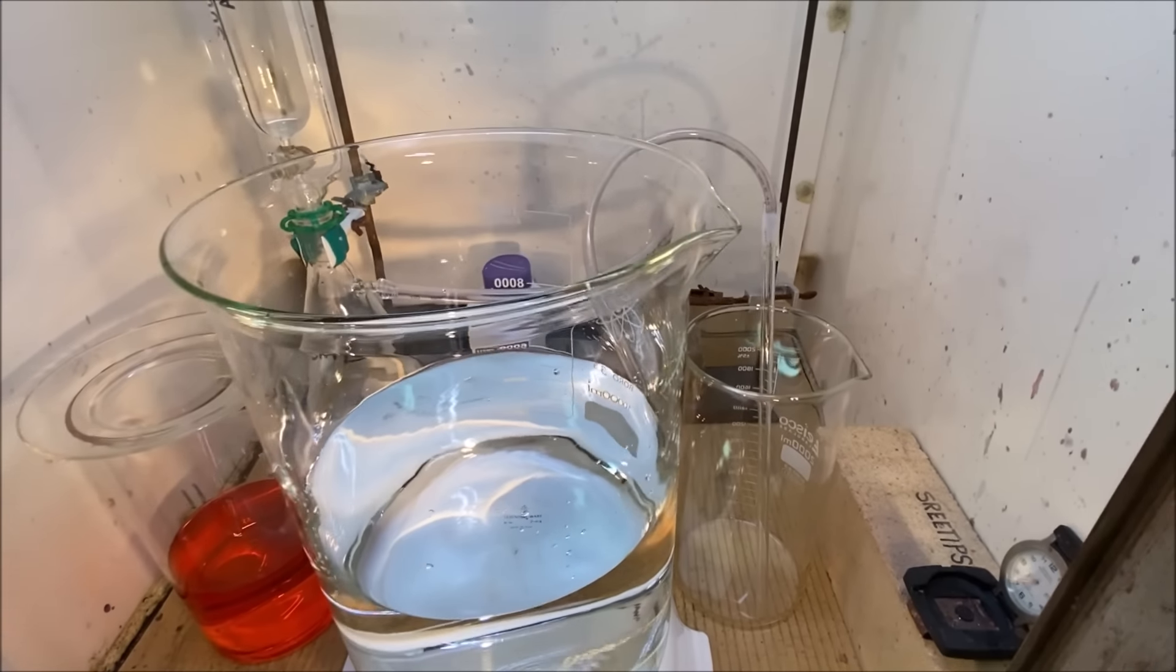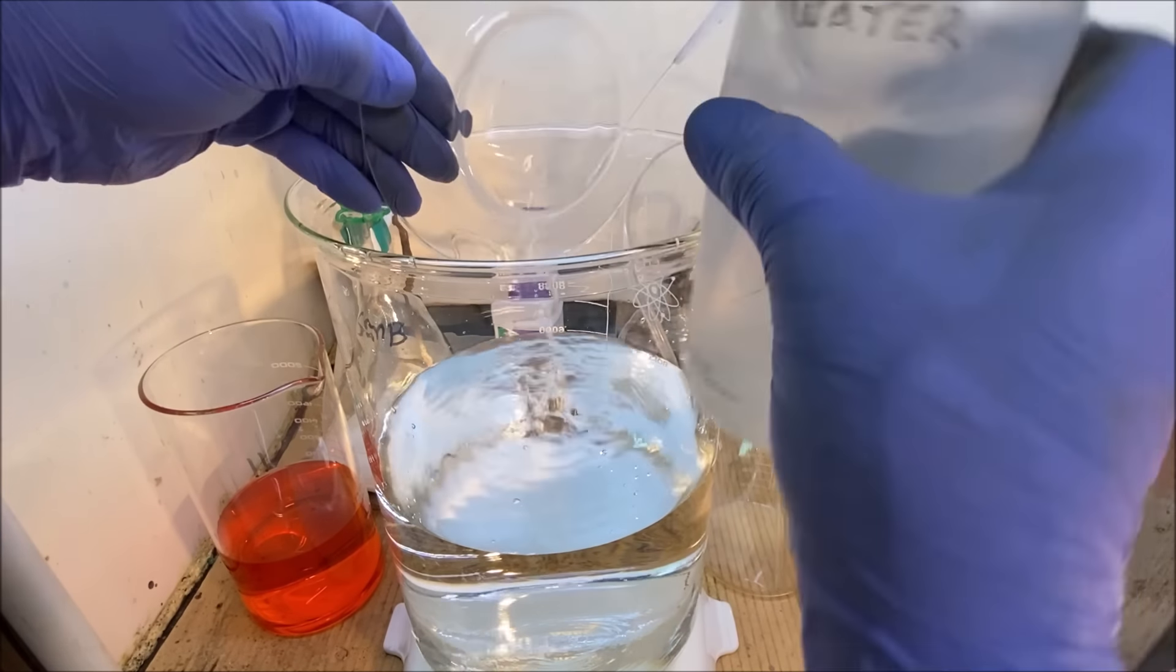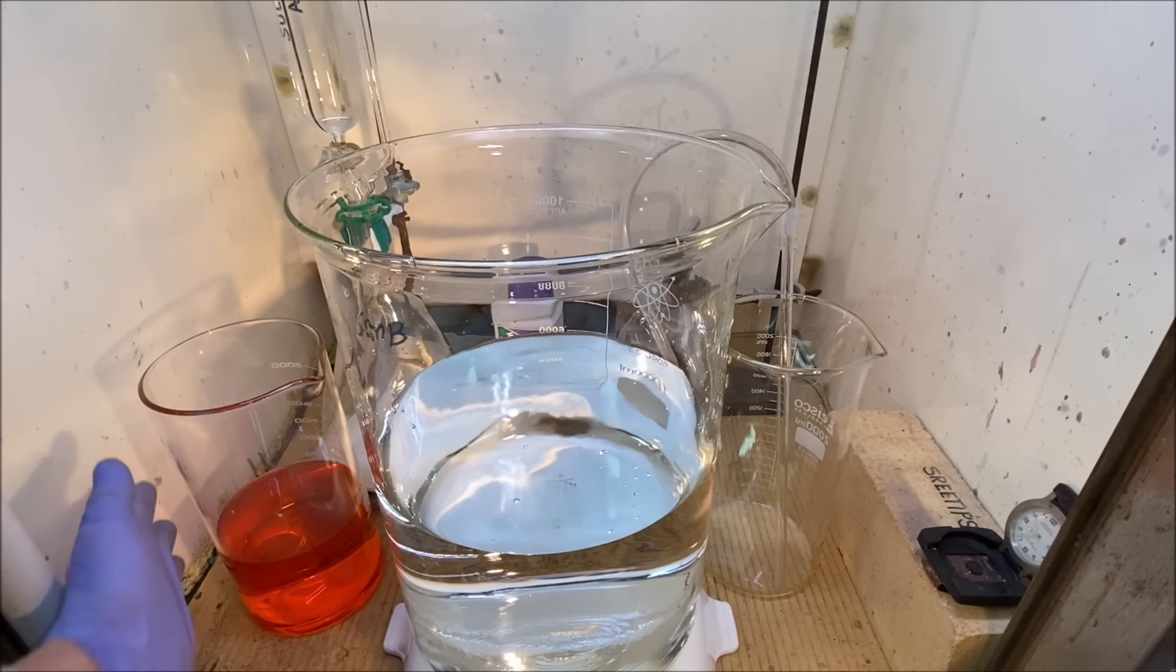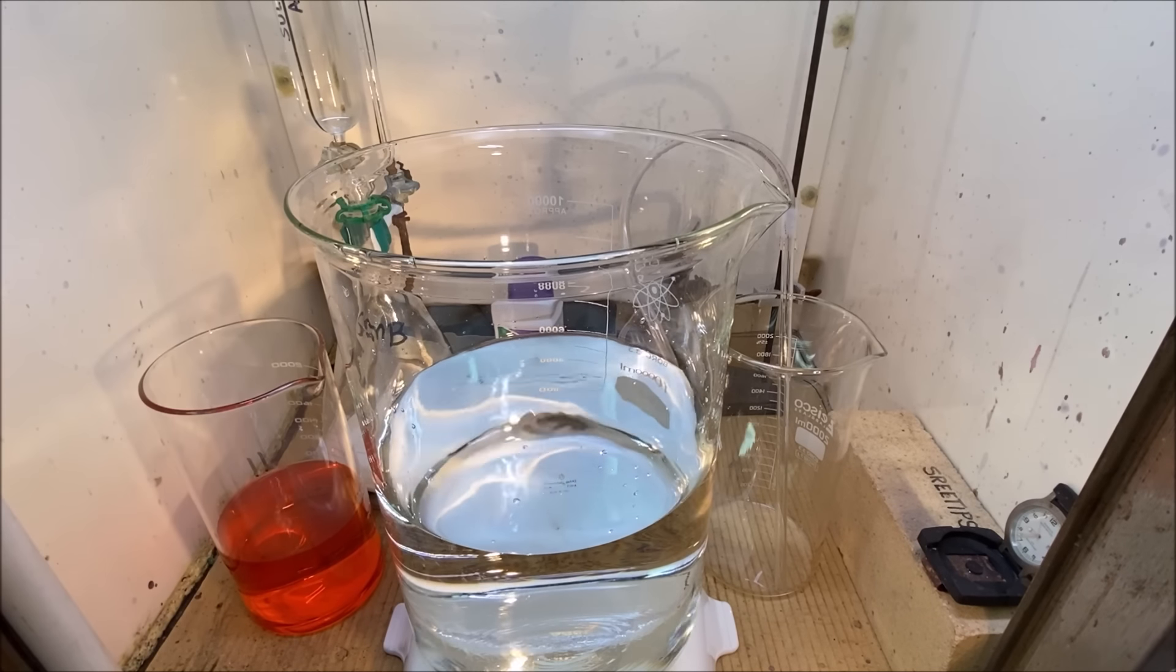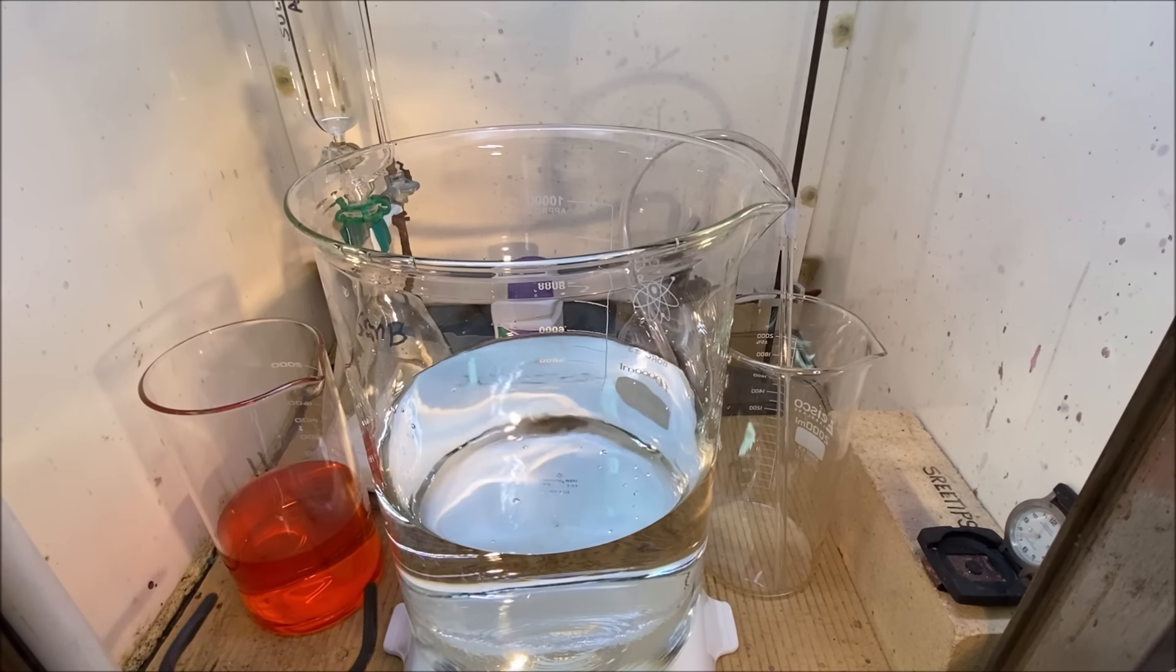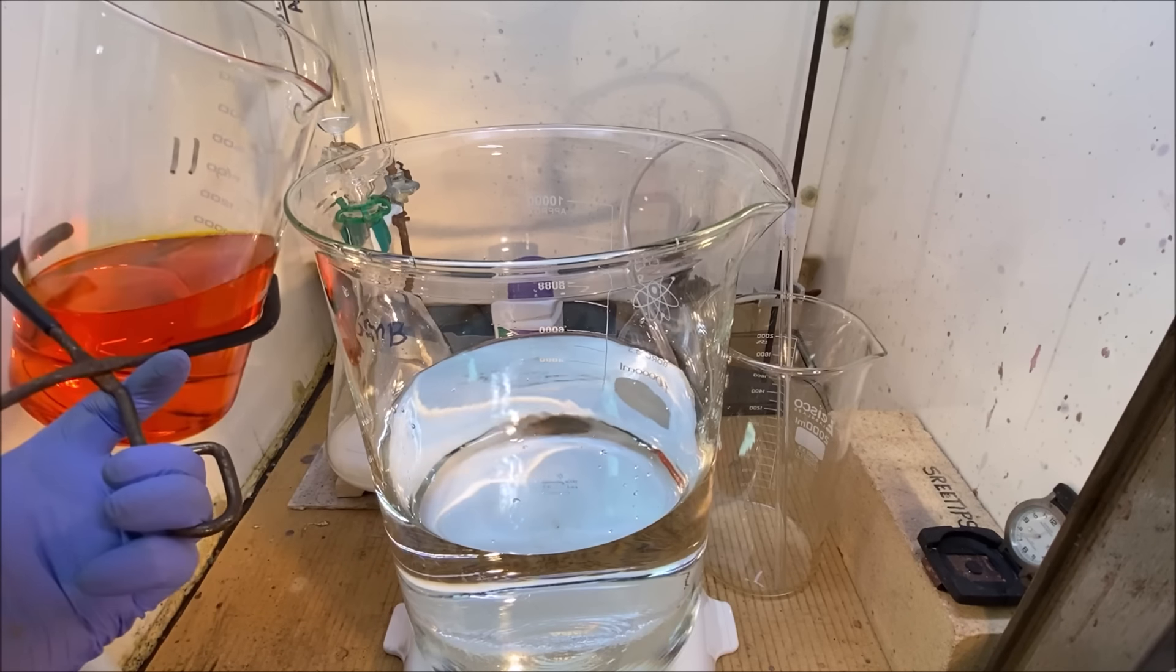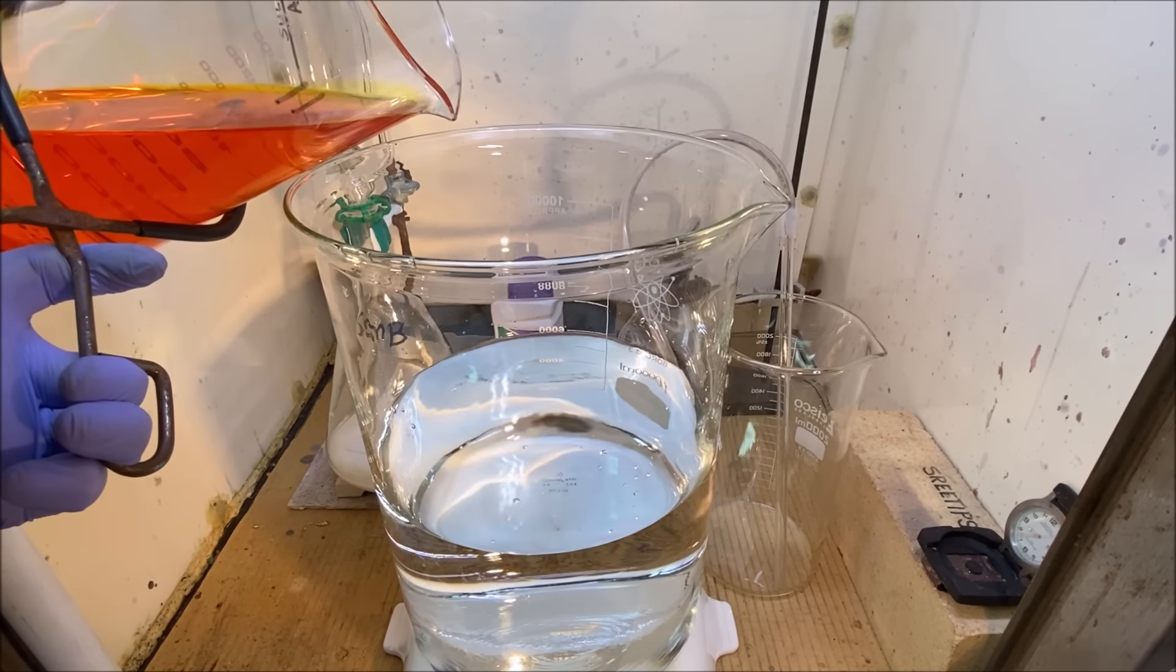All right, we've got a bubbler back there way in the back and that tells us that we've got a good gas flow going. Now we're going to add this gold solution to this water. I didn't even filter it. It's going to add this chloroauric acid solution right on into the 10 liter beaker that's got our distilled water. I'm going to add this right on in now. Here we go, see what happens here.